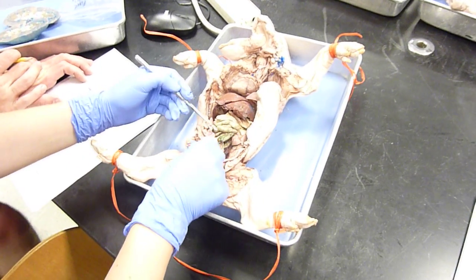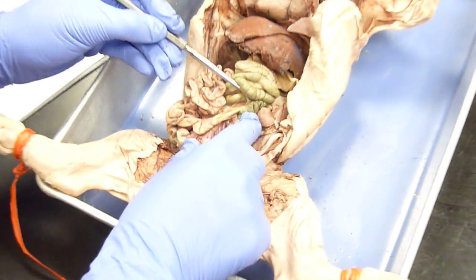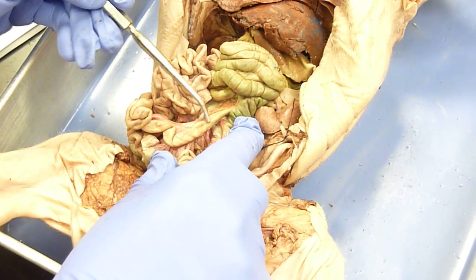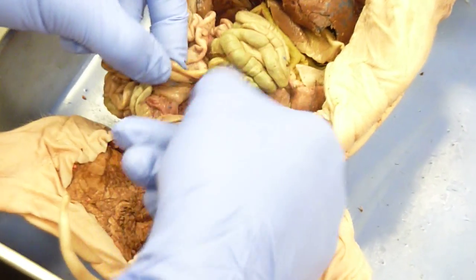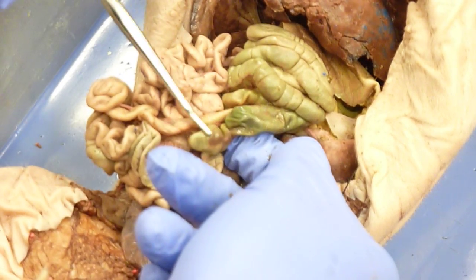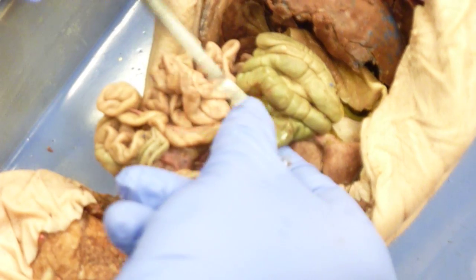Here's the end of the small intestine, and then it becomes the large intestine. This would be the ileum of the small intestine. And then right there you could feel the ileocecal valve right there. Then this blind end pouch of the large intestine — that's the cecum — how it just ends in a blind sac. That's the cecum.